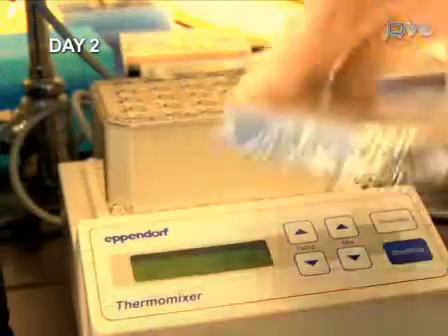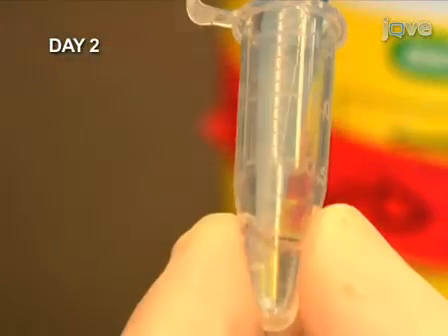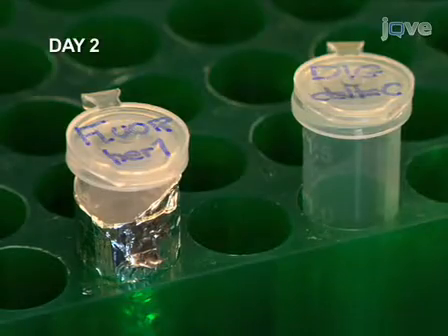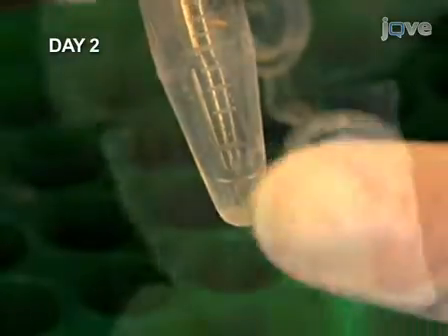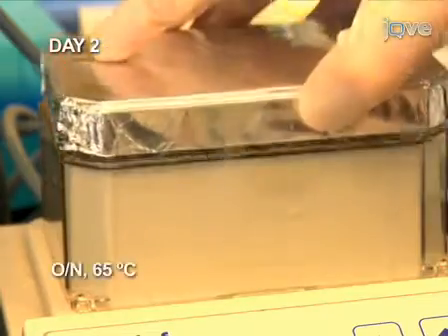Now remove most of the HYBE-plus solution, but leave 50 microliters, making sure the embryos are completely submerged. Add 1 microliter of each probe and mix by gently flicking the tube. Cover the tubes with aluminum foil from now on, since the fluorescein is light-sensitive, and incubate overnight at 65 degrees Celsius.